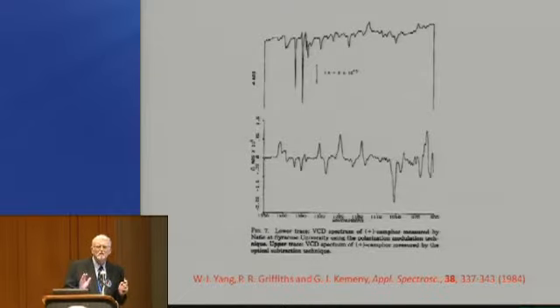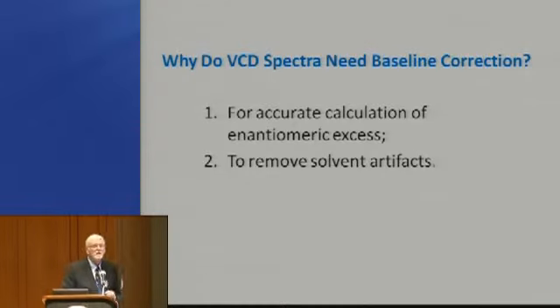The big problem is one of optical alignment with this system. You've got this massive optical path length, and they've got to be identical. I mean, they've got to be completely complementary to cancel everything else out, and it just proved to be extremely difficult to do this, and we never managed it. So that was my little foray into VCD, and my first recognition that Larry Nafie was a pretty sharp guy. And still is.